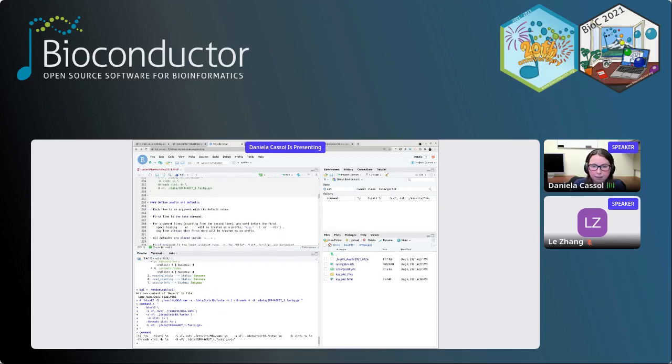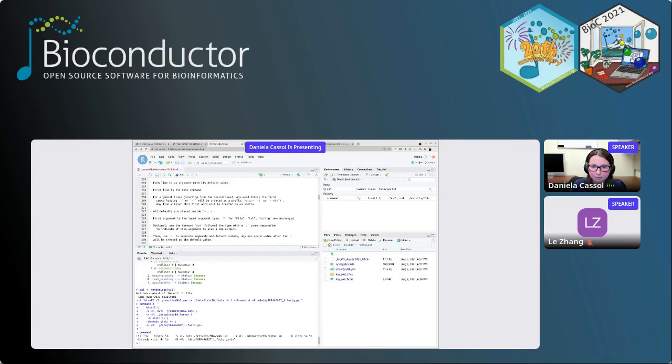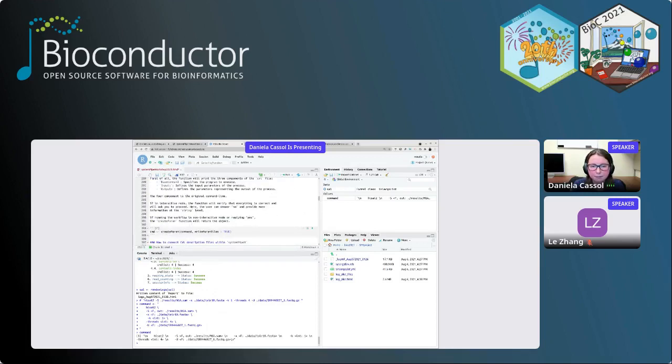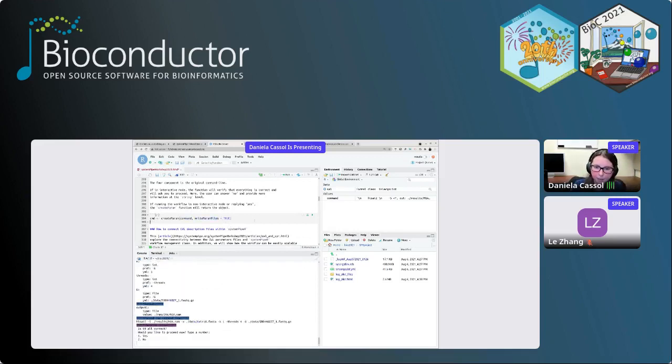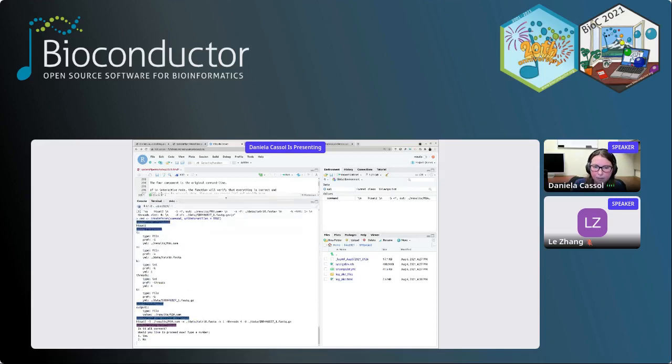Okay, so now I have some information here to specify all the details, and I am on line 304. Here you can find a function called createParam. What this function does is basically take that string, and here I'm asking it to write the description files we are creating. When I run this, we'll check a few details. I will print out the base command, so you can double check that everything is right. It will print all the input files.